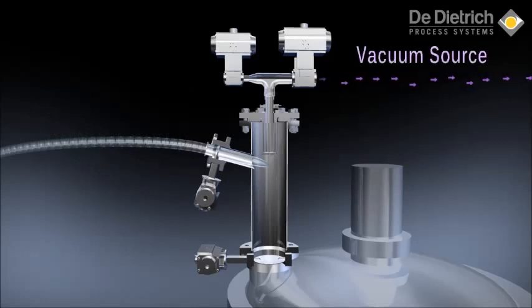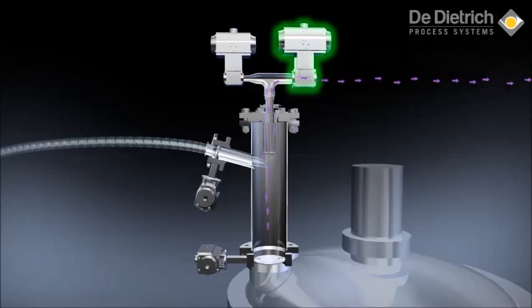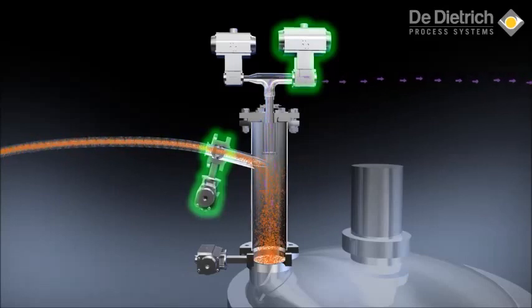With the vacuum source in operation, the vacuum isolation valve opens to remove oxygenated or solvent-laden air from the powder pump body. After a predetermined time, the powder inlet valve opens and solids are drawn into the body.